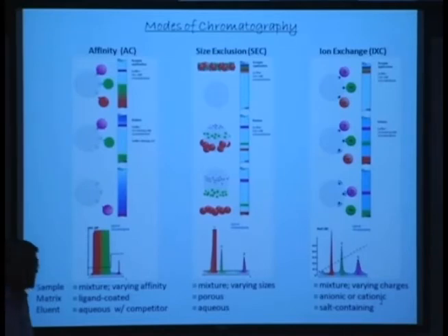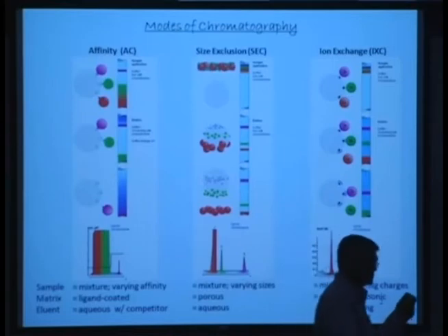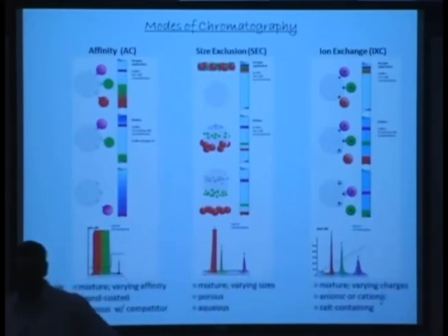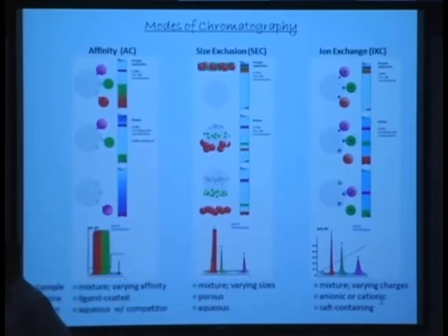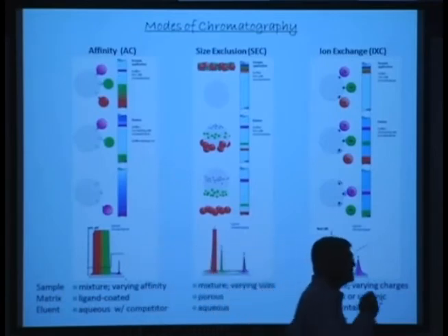In your eluent, you would get fairly high salt. So then you'll have to desalt in order to really purify. And desalting is a challenge. Why? Especially for glycans.